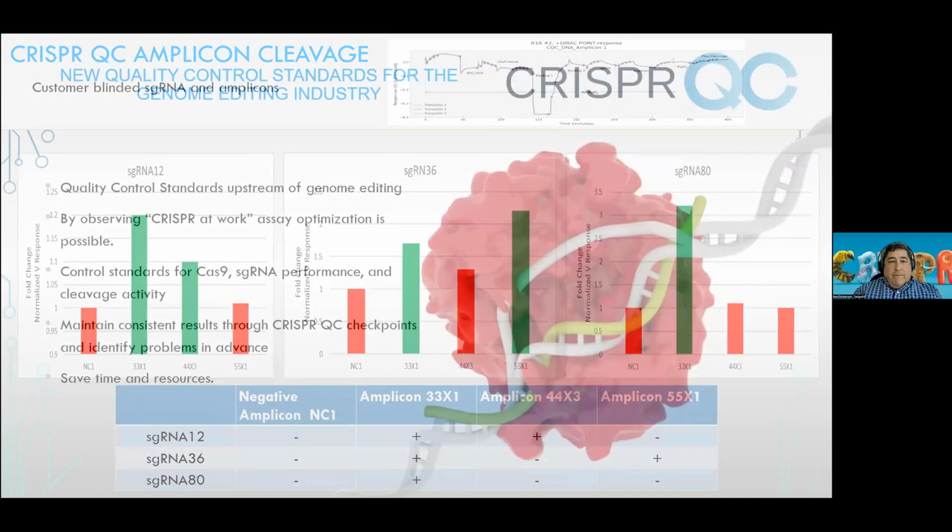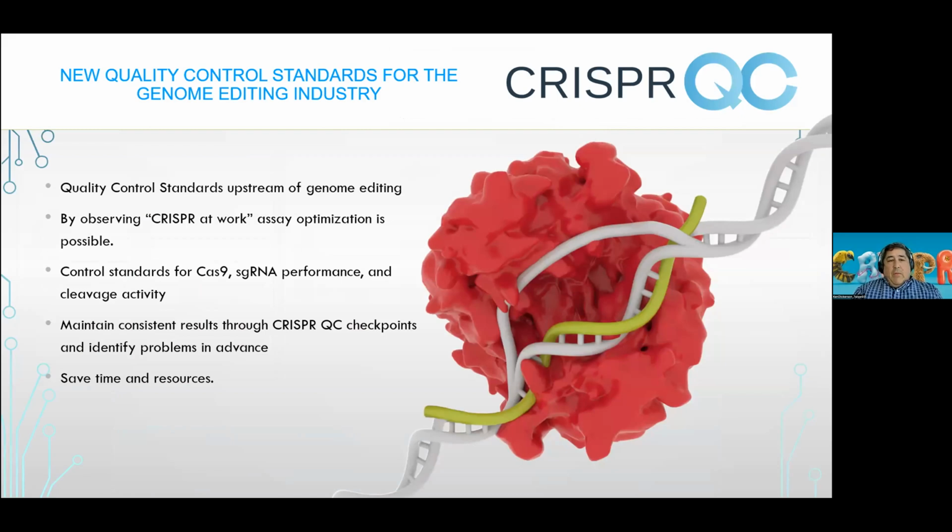All right. So at the conclusion then, what I hope that I've been able to show you is that we're able to set up quality control standards upstream of genome editing. And I think the word standards is really important here. Our goal here is to try to empower researchers with a technology where those different checkpoints, the checkpoints of Cas9 activity stability, the checkpoint of guide RNA assessment, selection, whether or not that RNP complex then has cleavage capability. We want everybody to have the ability to look at those and have a way to assess moving forward so that outcomes are improved, right?